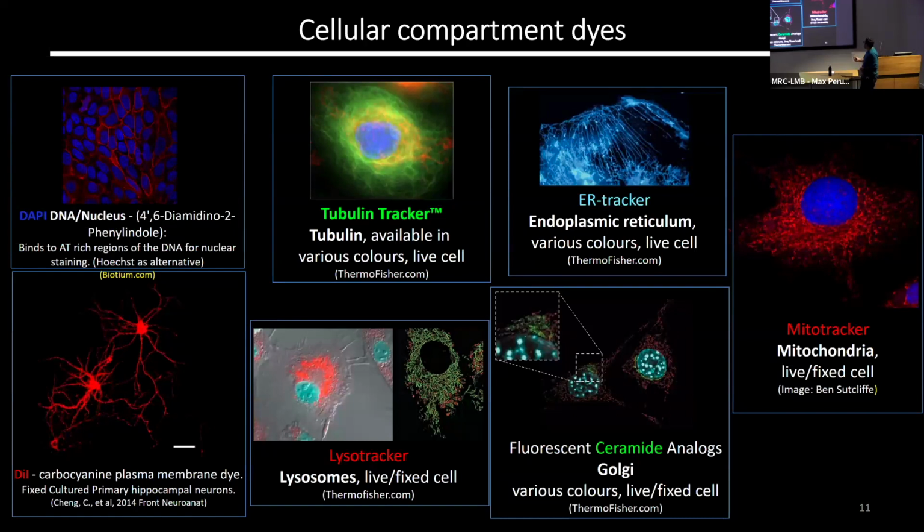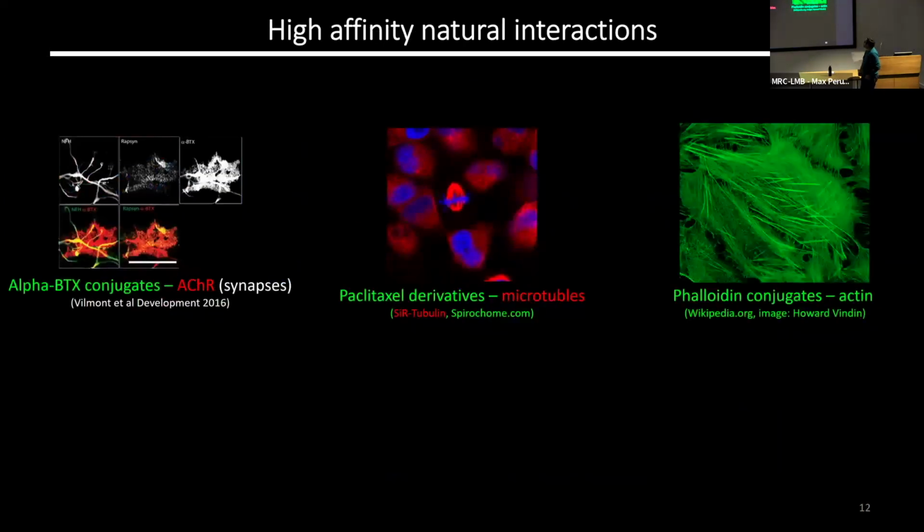So this definitely stays there. Okay, so you also can take advantage of high affinity natural interactions. Basically, some molecules have a higher affinity for specific components of your cells.